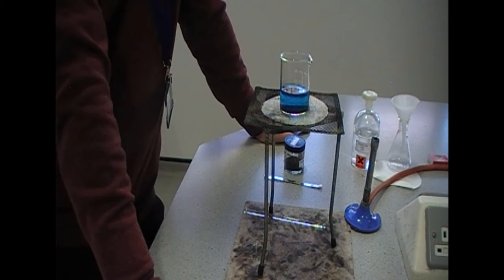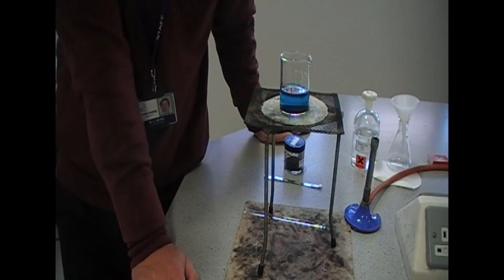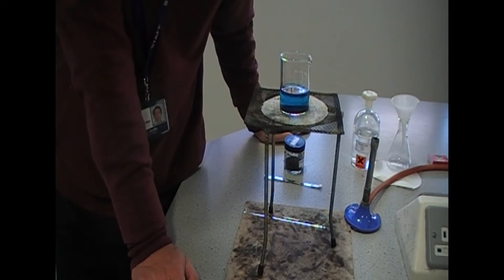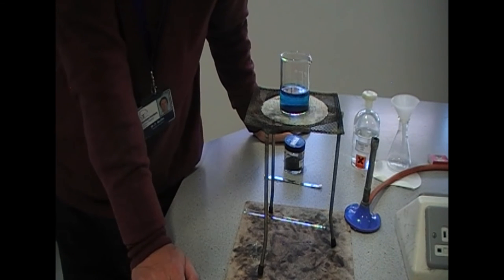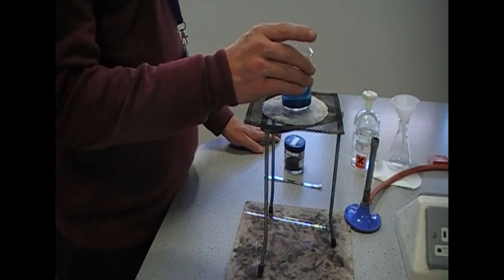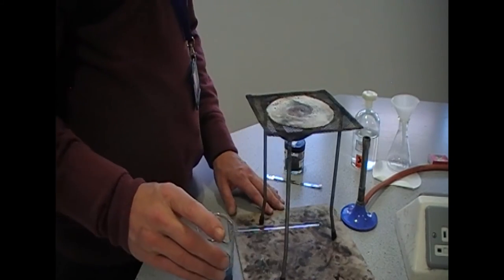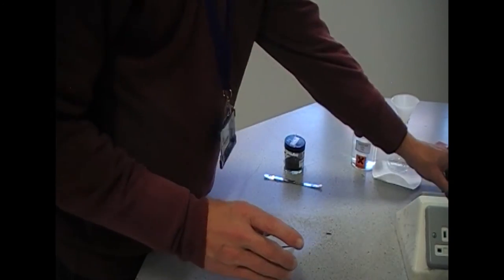We've got to the stage where we've got a blue solution and some unreacted copper oxide at the bottom. Which means we can now go on to step five. Set up the filter funnel and paper over the conical flask using the clamp stand to hold the funnel. Filter the contents of the beaker from step three. I've left this for a while so it's quite cool to the touch. We can move the Bunsen burner and tripod away for a moment.